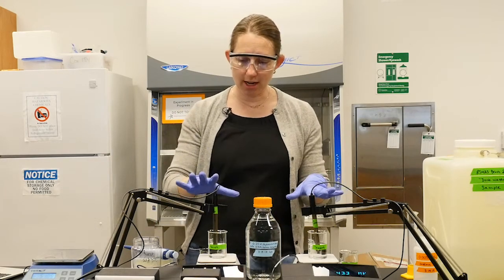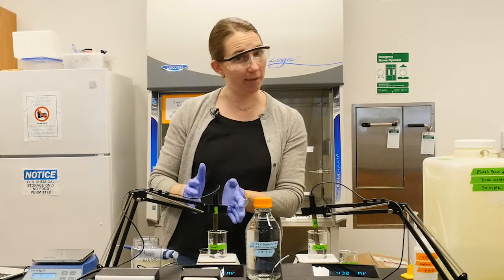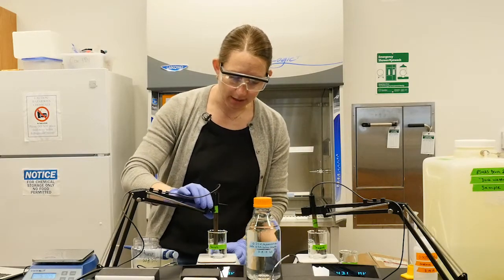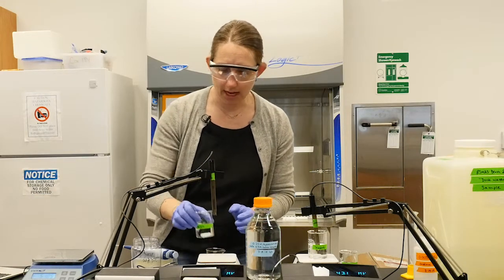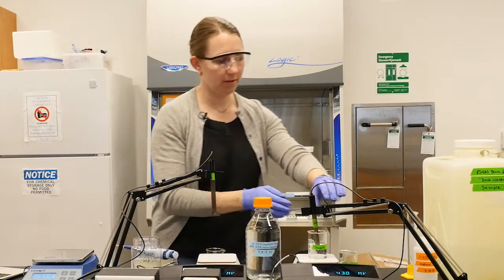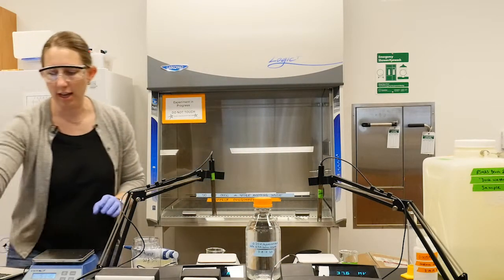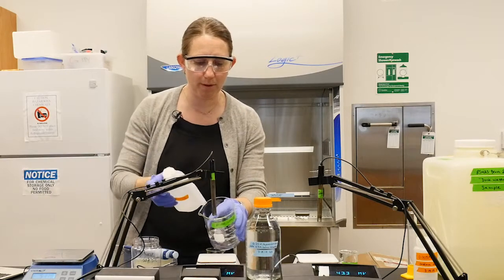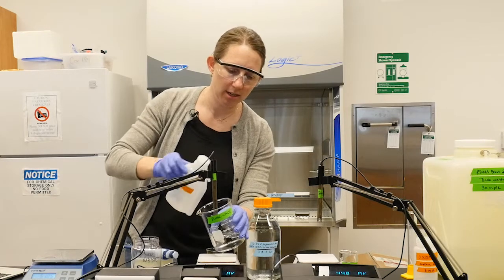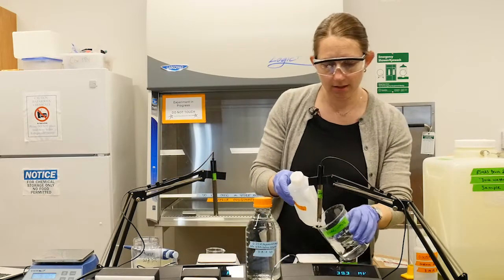So again, we've got our sample set up here and our standard set up here. And they've just been equilibrating. You want to keep these probes nice and wet all the time. So we've just had them waiting in some seawater until we're ready to go. So I'm going to lift this out and take off our equilibration beaker here. Lift that out. Okay, and then I'm going to rinse these before we drop them into our samples. So we've got some nice clean deionized water here for cleaning those probes. Rinse both of those.